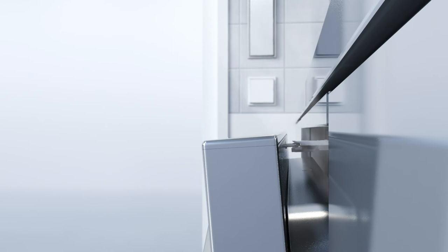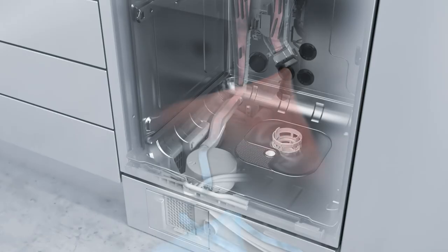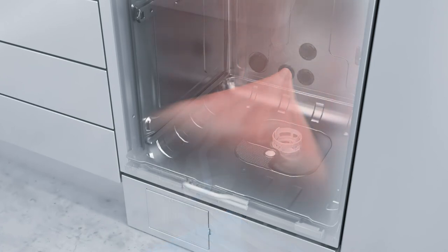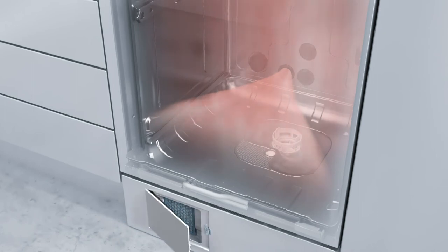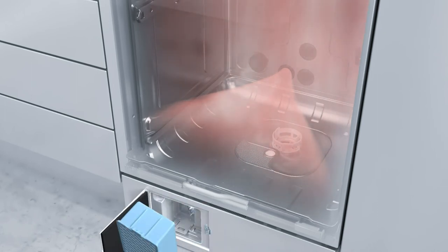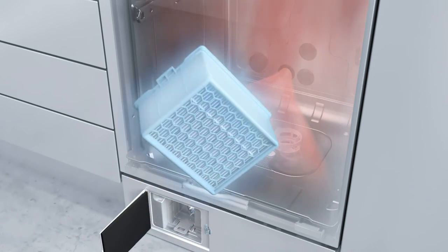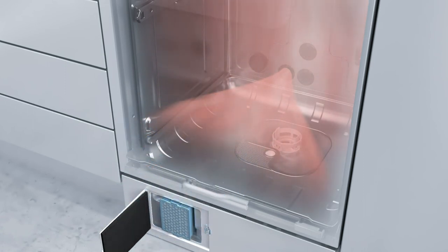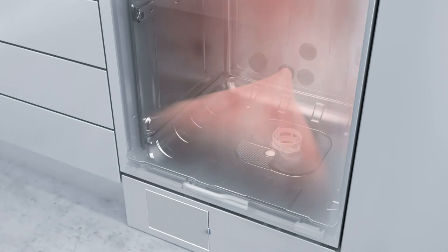Models with Dry Plus hot air drying represent an ideal solution when dealing with intricate and narrow-lumened laboratory glassware and equipment. An upstream Class H13 HEPA filter ensures the reliable removal of particles from the air taken in for drying. The filter is easily accessible via a hatch in the front plinth.